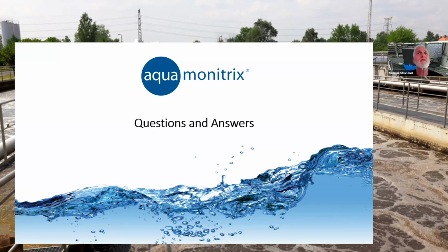And then the other one, which is a great question for the head of R&D: does the analyzer have an option to add ammonia? Interesting, because we are all familiar with the drift in other systems, about which we could not comment, of course. But if you can handle that, Eoin. Yeah, that's something we've been working on for many years now. The goal is to have something available this year, but of course with all developments there's no certainty right now.